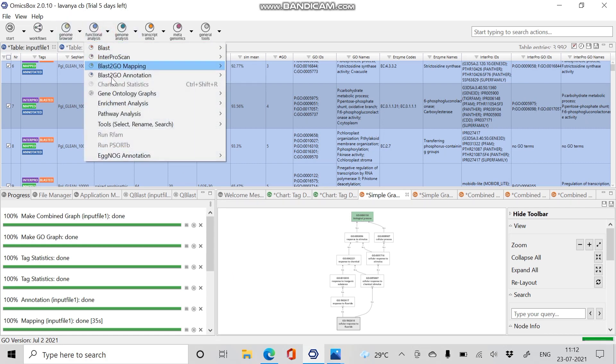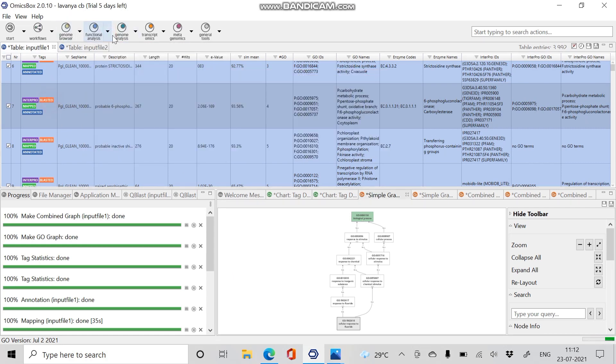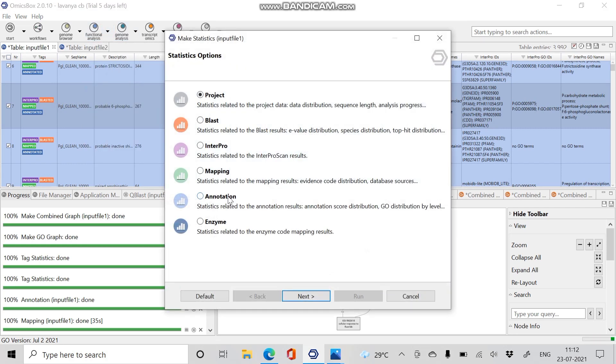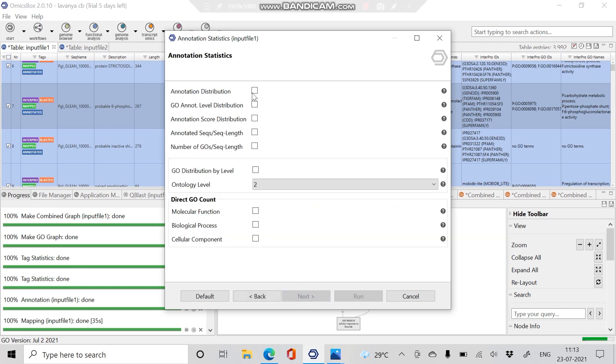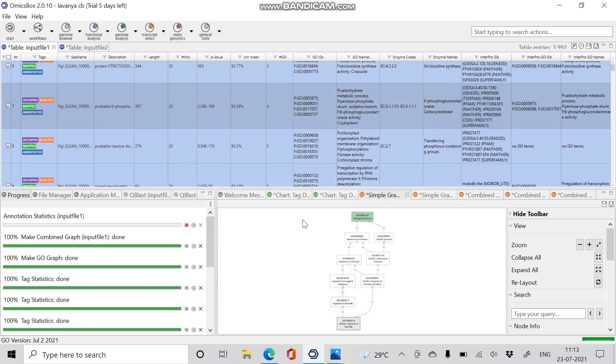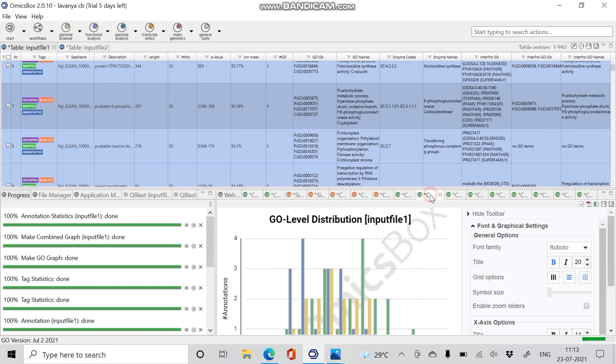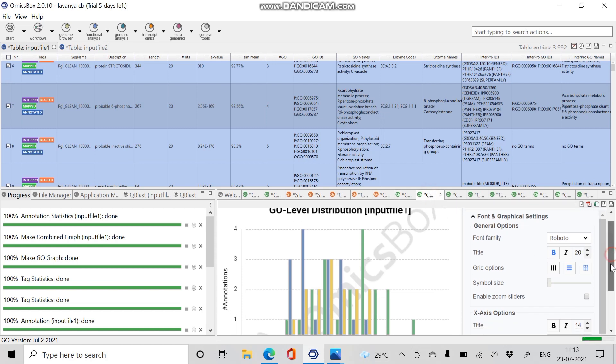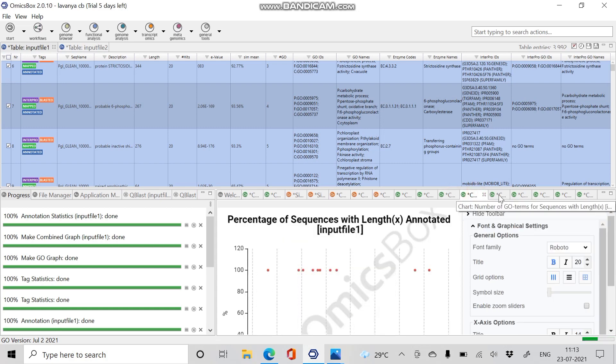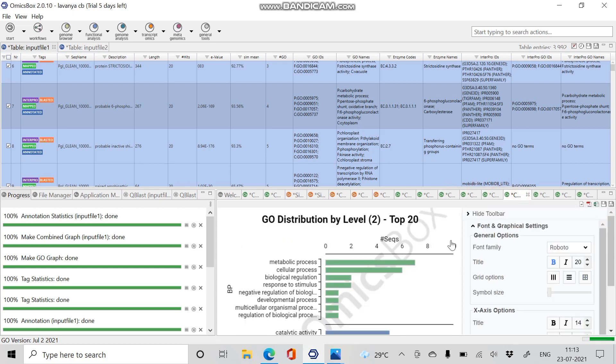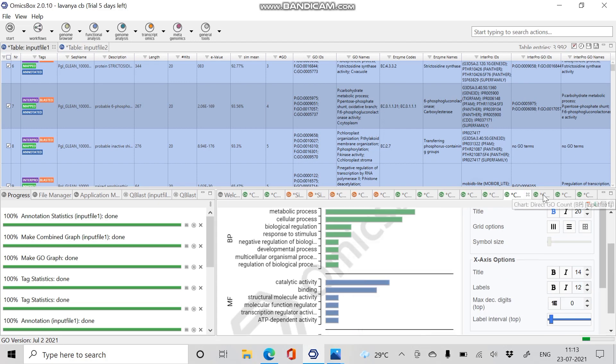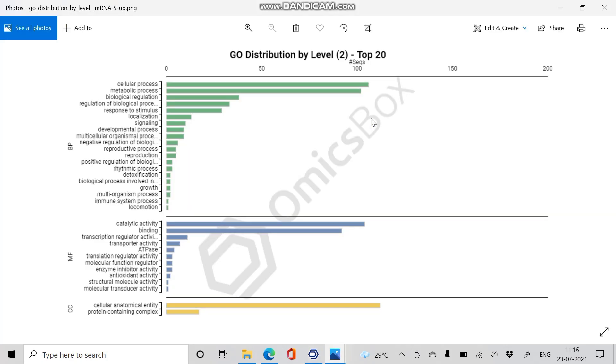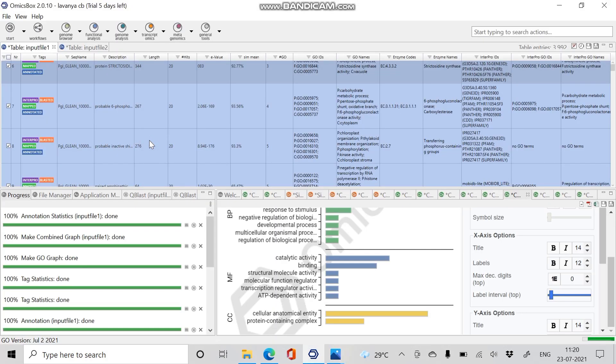Next we have to proceed with charts and graphs. Go to Functional Analysis, click on Charts and Statistics. We are going to create the charts for the annotation results, so click Annotations and Next. In the annotation statistics, proceed with the following information which you would need in the graphs and click Run. As the result, the annotation distributions for all the GO level distribution has been obtained. In the GO distribution by level, click on this chart and save the chart. The chart describes the GO distribution, that is gene ontology distributions of sequences to biological process, molecular functions, and cellular component.